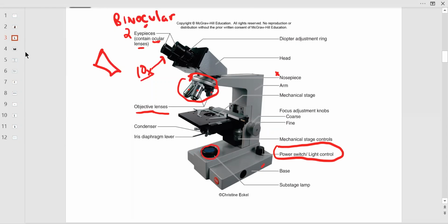And if you don't see the light, you could, of course, adjust the condenser in the iris to let the light in. And sometimes the light has a dimmer, you know, like a dimmer like in your wall. So your light source sometimes has a dimmer dial where you can intensify the light. But that's really painful if you really look into a microscope and the light is so bright coming in. So the brighter you get, the darker the specimen. You know, if the specimen is light to begin with, you don't want to burn your corneas off, right? Which you'll learn in A&P too.